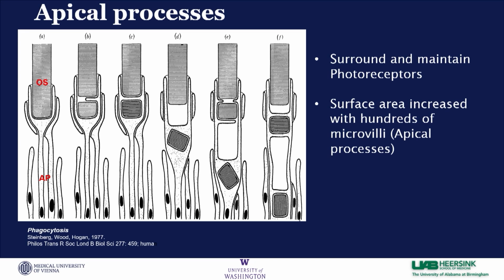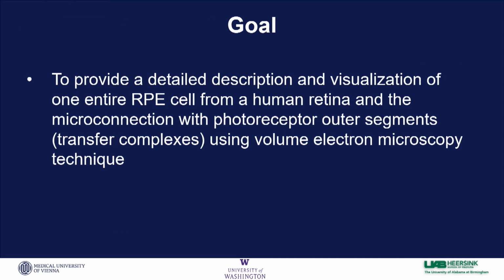And our goal in this study was to provide a detailed description of a single cell out of the entire cluster of RPE cells, and describe their inner workings and their components. And because this kind of research is fairly sparse in this field, I'll let you know a little bit about how we're doing this.